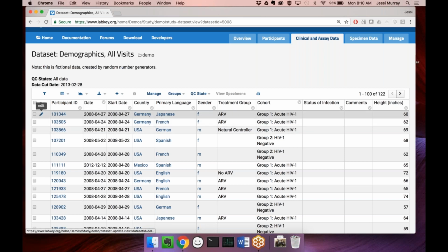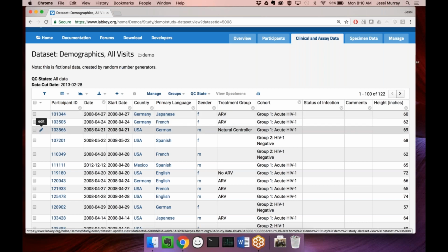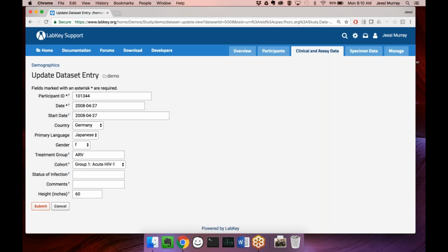Again, with the space-saving items, instead of having a big column of edit links or detail links that takes up a ton of room on the left-hand side, we tried to collapse these to icons. So if I wanted to edit this entry, I still can, but it's now not in my face so much. Again, this is something where we think that is a scenario that we need to enable, but we don't need to scream it at you.